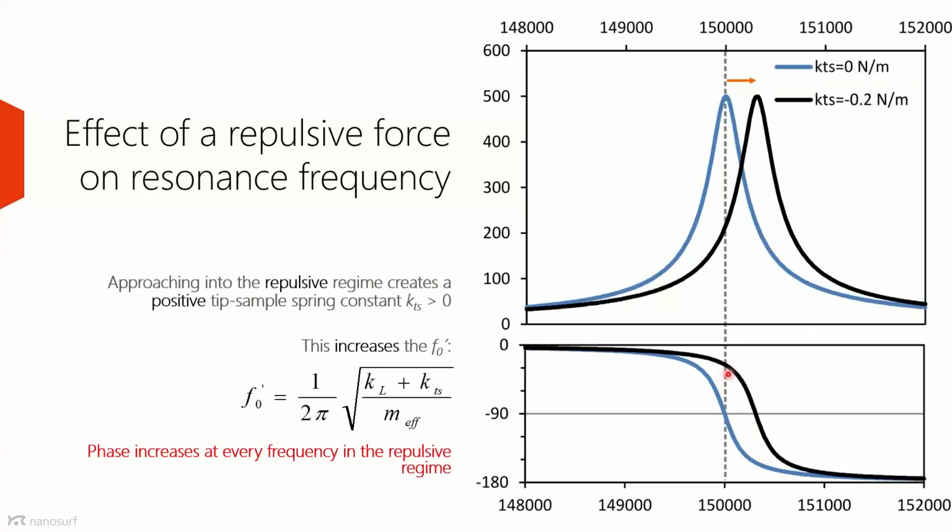So you see if the resonance frequency of the interaction is changing, you will see automatically a phase contrast. During imaging, this will happen automatically. If my sample gets higher, shortly the amplitude will drop. And when the amplitude drops, it means that the resonance frequency has shifted, and that also results in a phase shift, until the feedback loop has restored the amplitude and you're back at your original. So topography always comes also into the phase image.